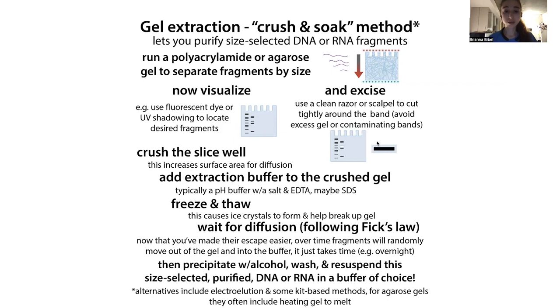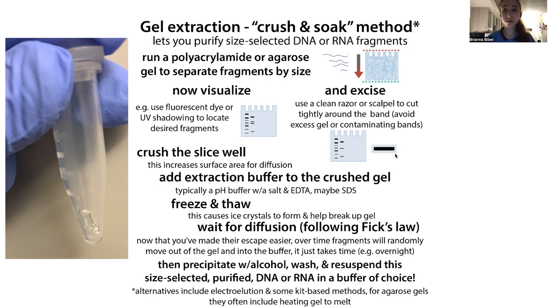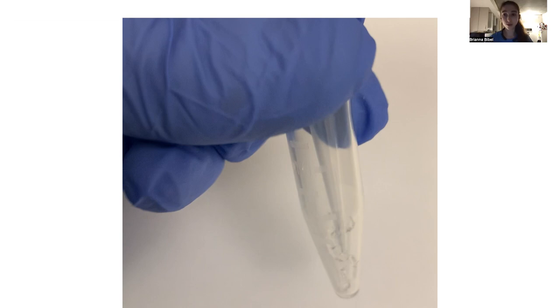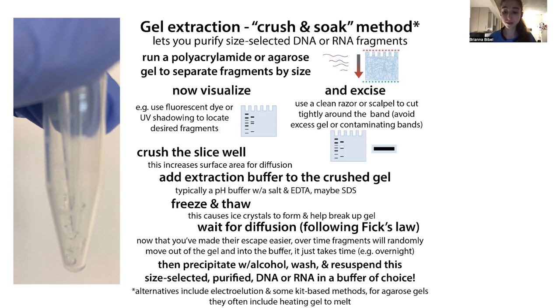Cut out your band, and it's really important to avoid too much gel around it — you're trying to get it out of the gel, so excess gel can interfere with downstream steps. Also, don't cut into any contaminating bands. We're doing this to purify, so we don't want to recombine it with whatever we just separated it from. Now take this little slice, stick it into a microcentrifuge tube, and crush it. This increases the surface area, giving molecules more opportunities to escape via diffusion. You can use a P1000 pipette tip to crush it against the wall of the tube — just make sure you're not losing material stuck in the tip.